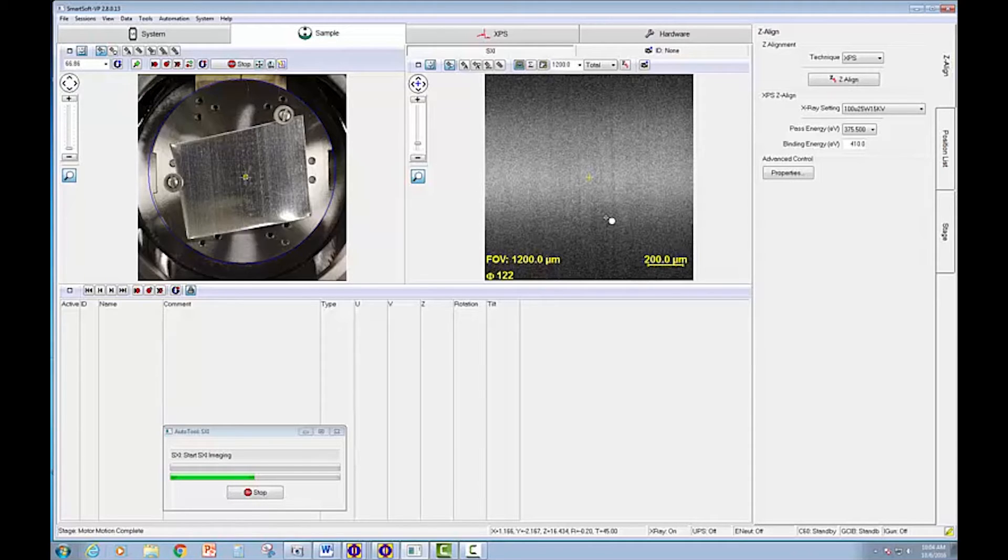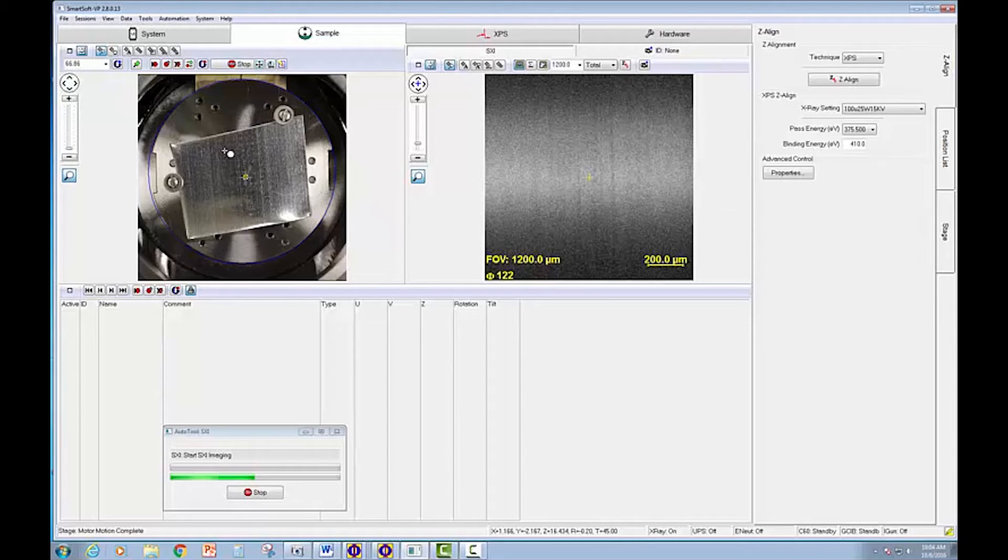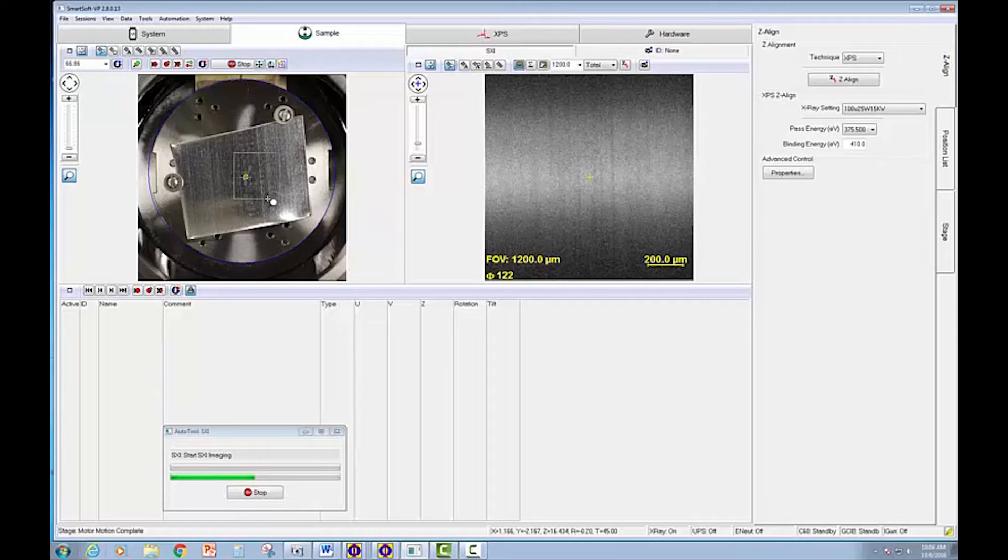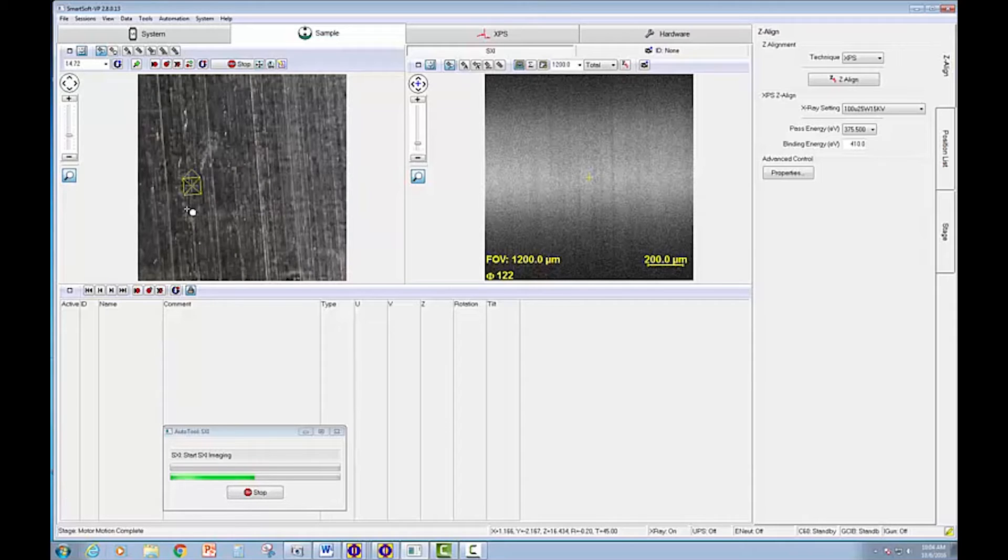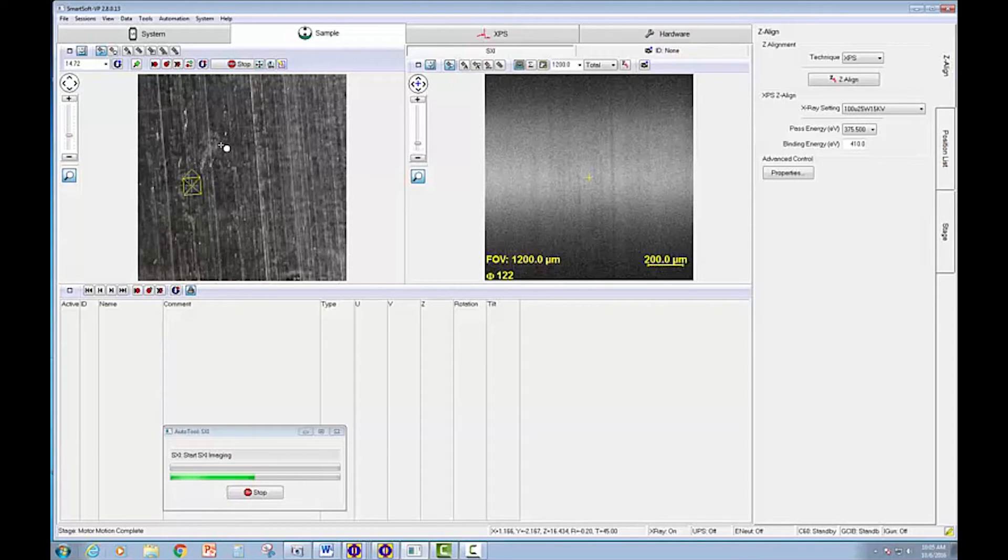What we want to do is use the SXI imaging to look for some defects. So I'm going to zoom in on the optical image and see if I can find a place where we want to look. Generally, it's fairly uniform. I can see maybe some indication, optically, of something going on over here. So why don't we go ahead and move up there.